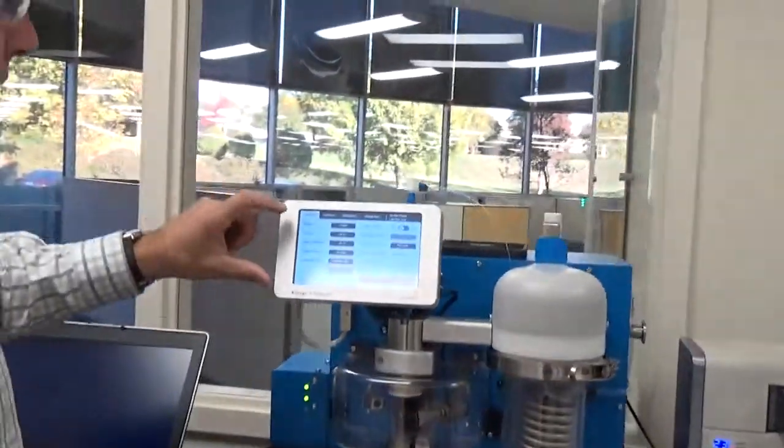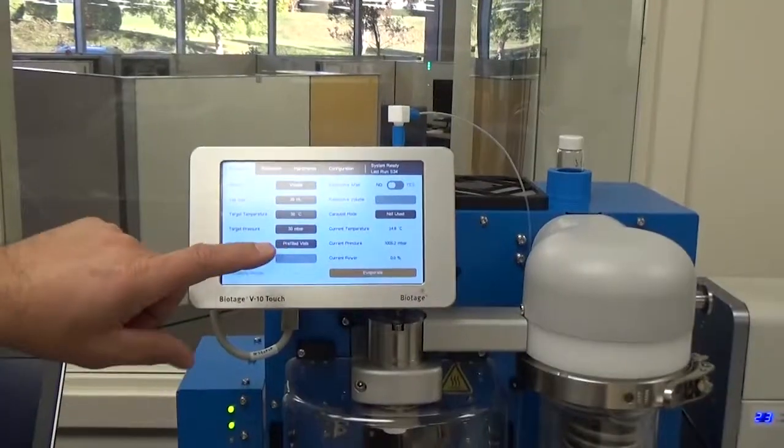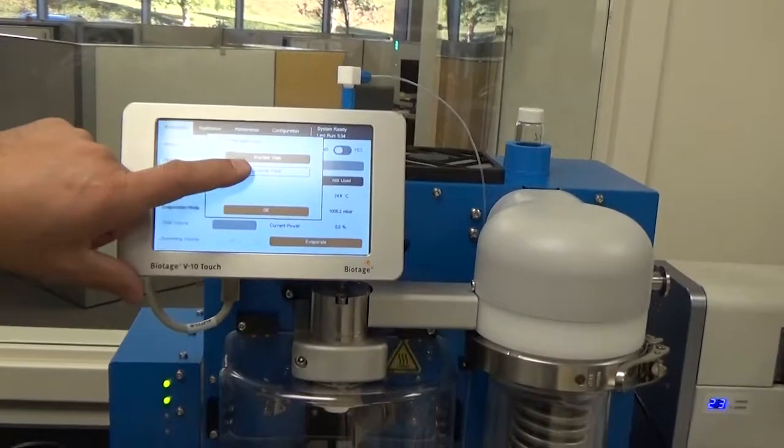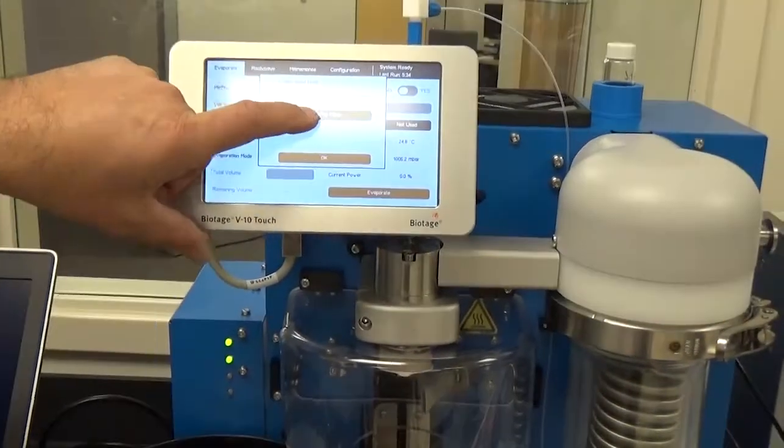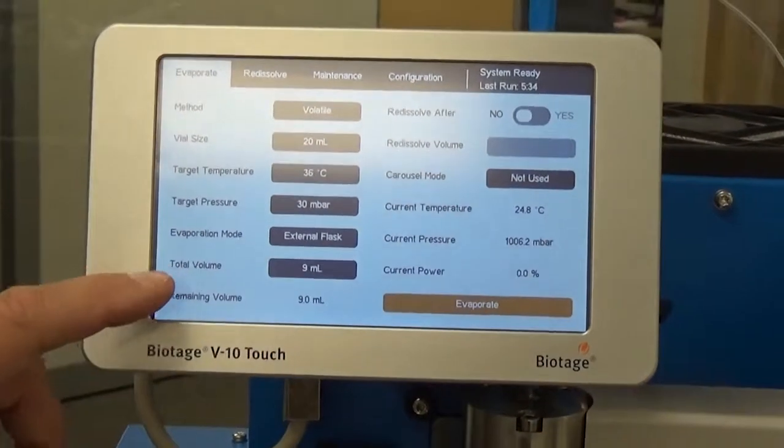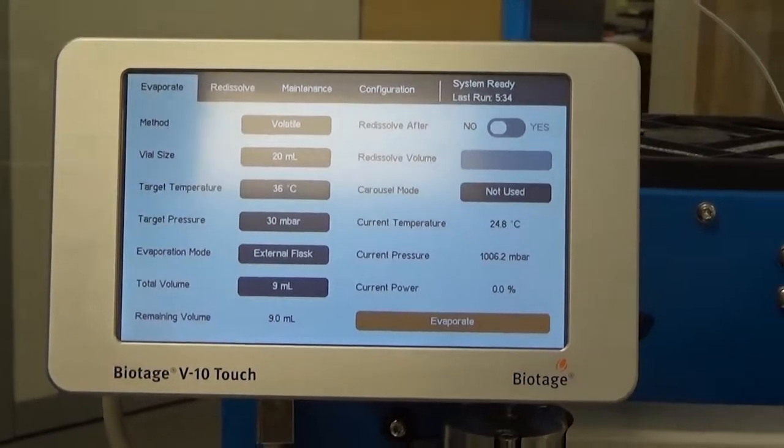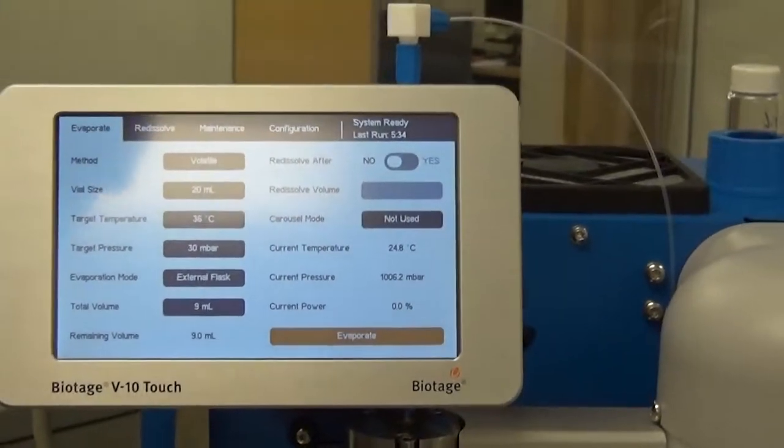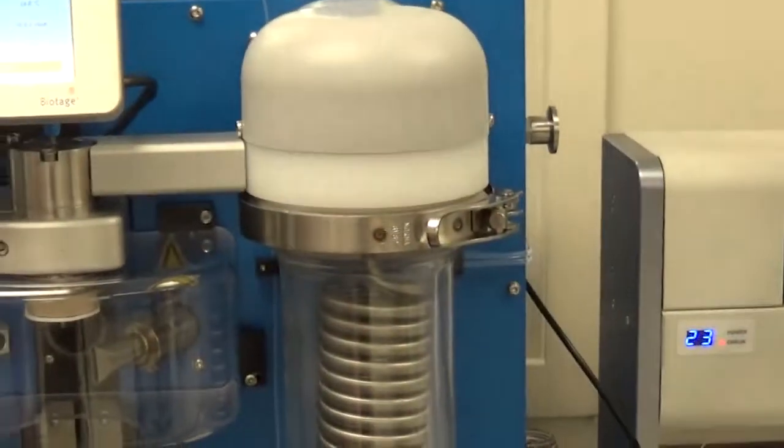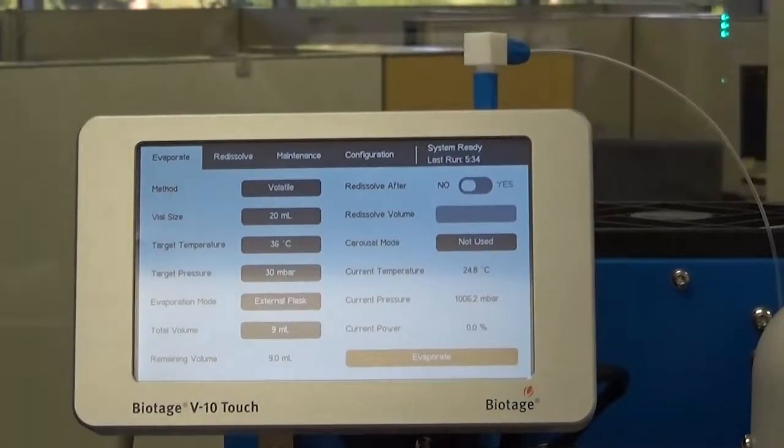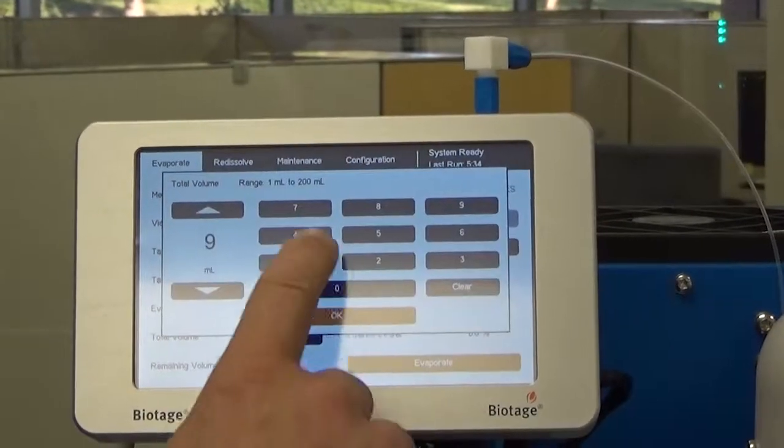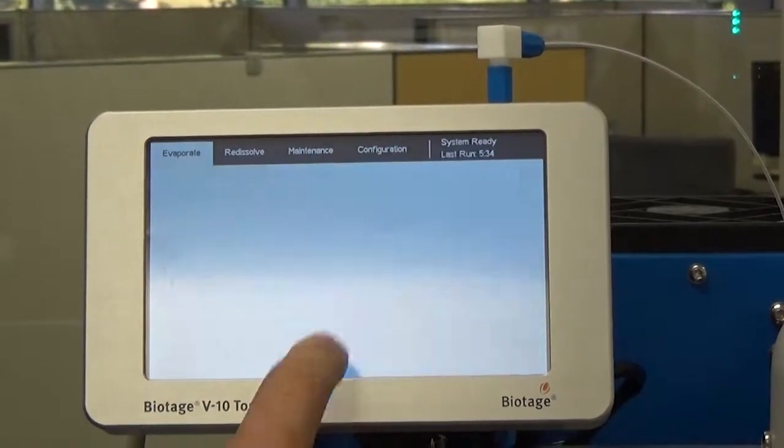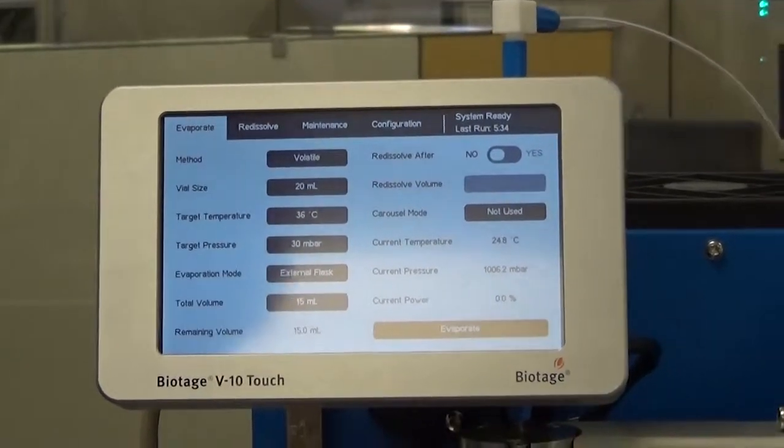And then over here on the software, what you want to do is not use pre-filled vials, but use an external flask. And my total volume that I'm going to use, I could take all of that material right there, but I'm just going to take 15 mils. So I'm going to choose to take 15. And just to demonstrate that.